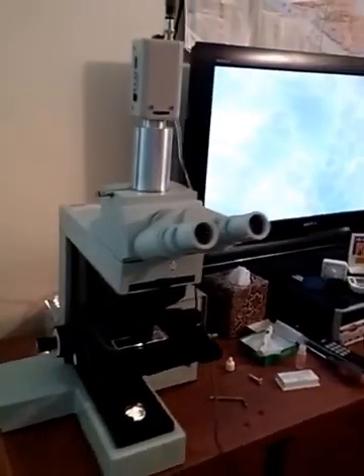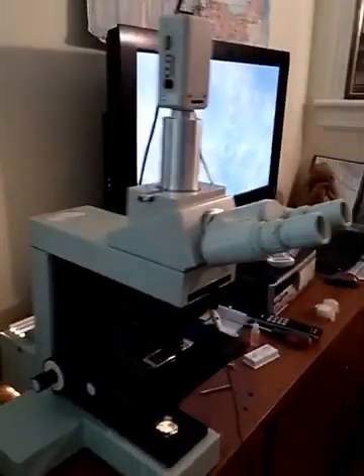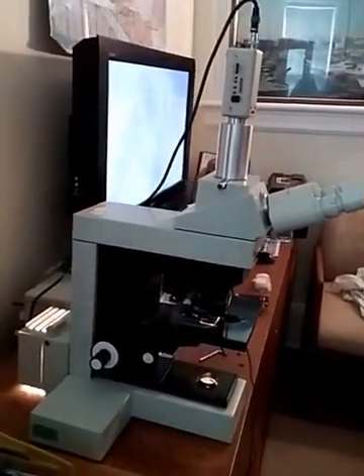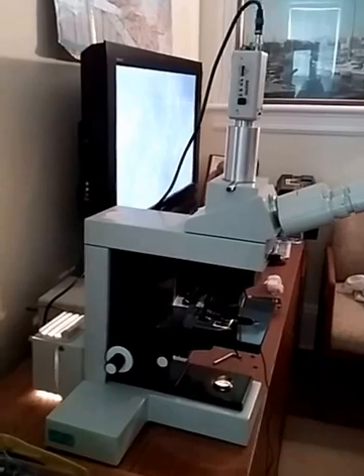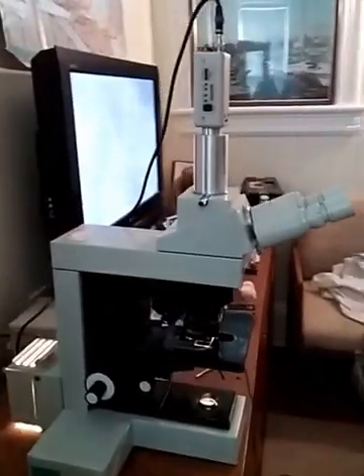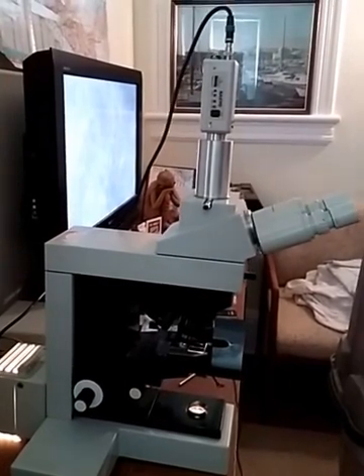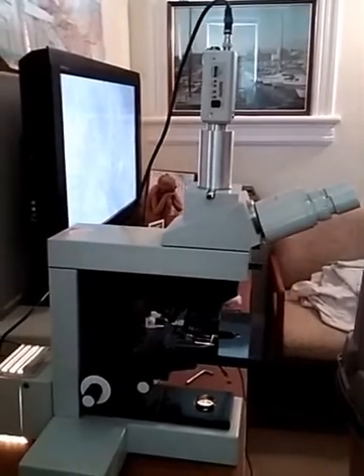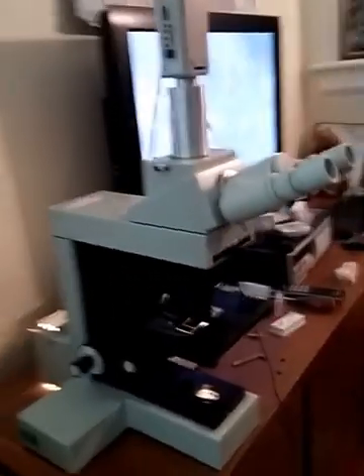I used this scope full-time for about seven years maybe. I always had other scopes as well, but this was my favorite. This one was the most consistent — superb pictures, and was stable.